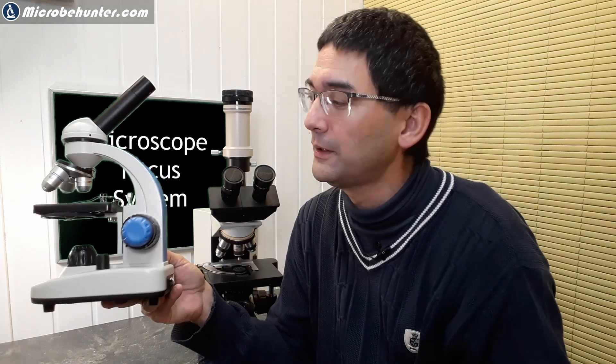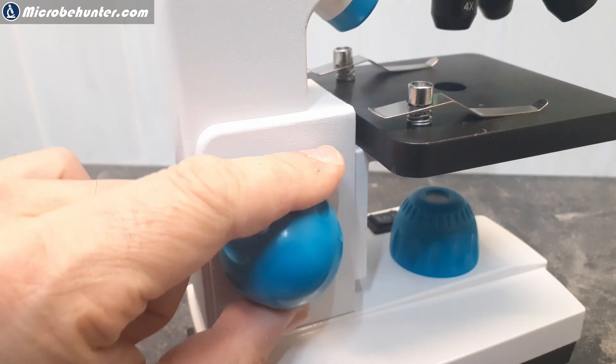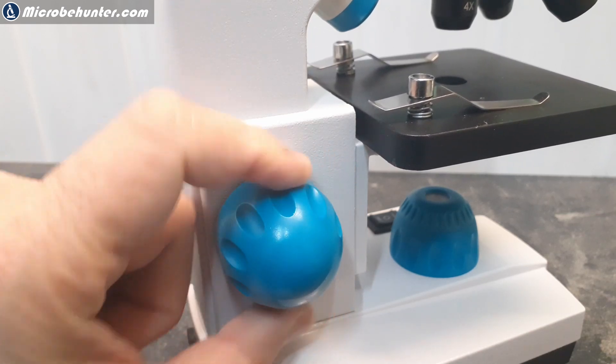Before I stop — there are some microscopes where the two focusing systems are not on the same axle; the fine focus knob is up top and they're separated. That's also a possibility. Most microscopes have both a coarse and fine focus system. Some children's microscopes and very basic compound microscopes only have one focus knob — not only to keep cost low, but also to avoid overwhelming children with too many controls.